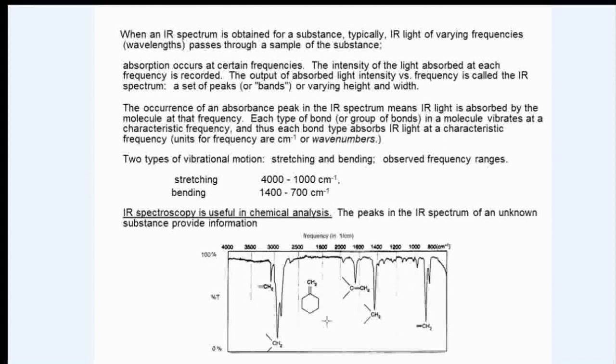Specifically, what happens is every time there is an absorption of an IR photon of a given frequency, a peak is drawn, and that frequency value is recorded. The peak that appears will have a certain size. It's displayed as peak intensity, and a certain degree of broadness. IR peaks vary in their degree of broadness sometimes.